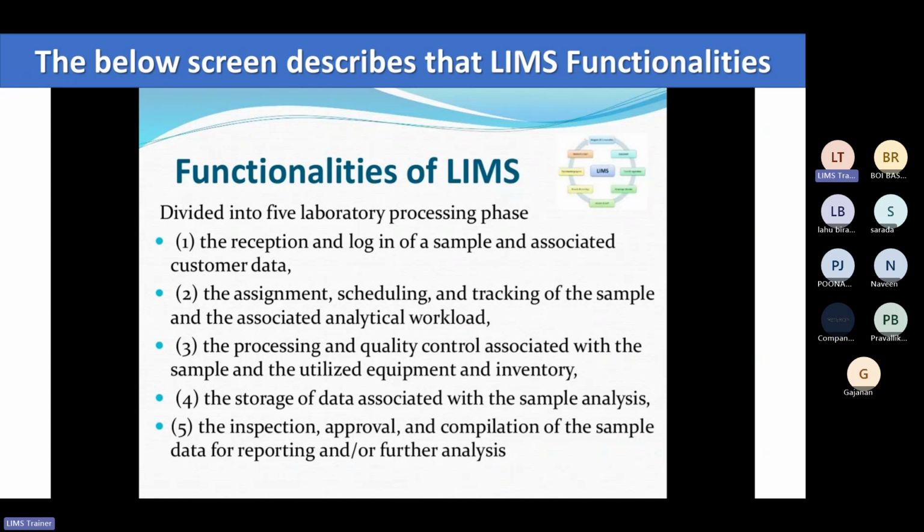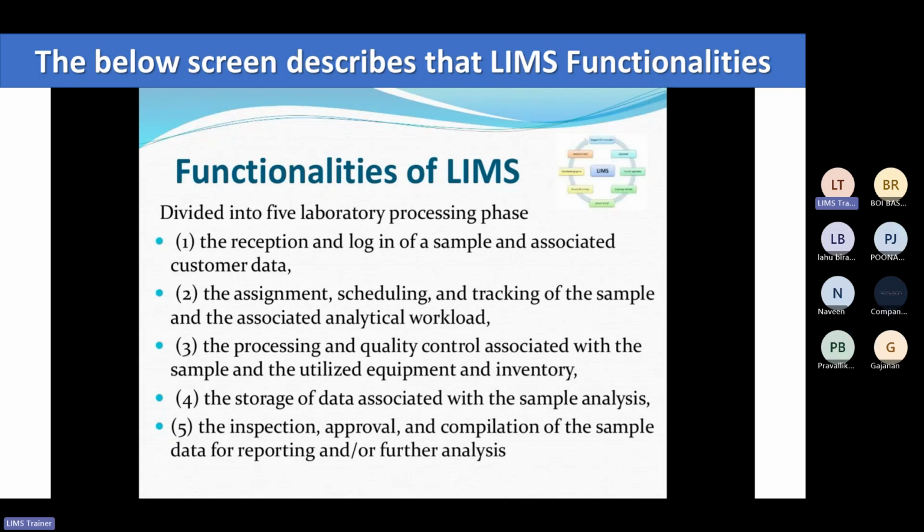Then comes the processing, then quality control associated with the sample, and the inventory related to that particular laboratory. The storage and handling of the data generated with that particular sample, and also the accuracy and privacy of the data, that is the functionality of the LIMS. Then comes the inspection, approval, and compilation of the sample data, and reporting also for further analysis. If it is required as a reference for further analysis, that is also provided by the software.